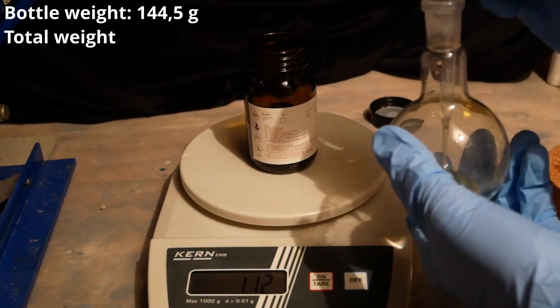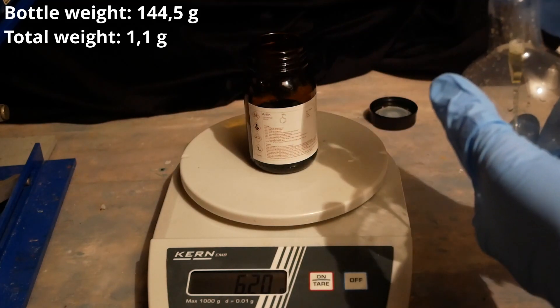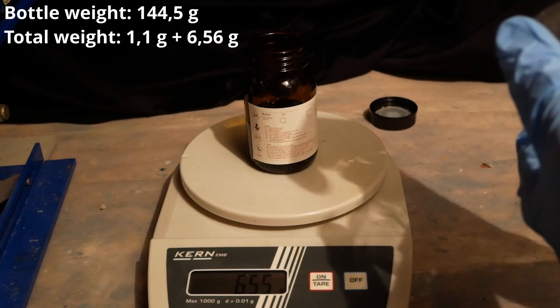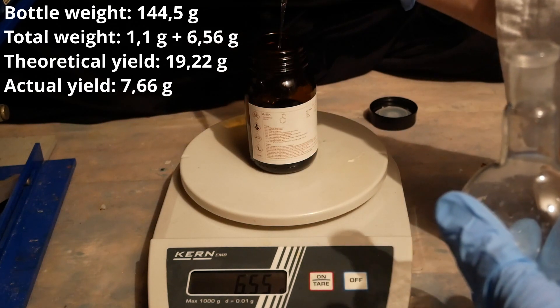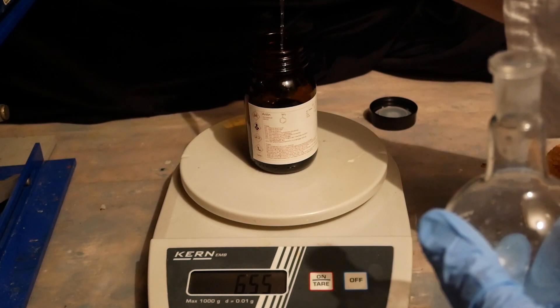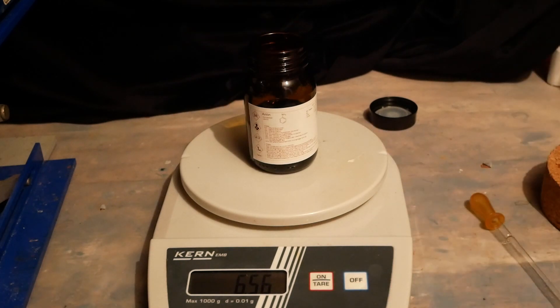I accidentally didn't tare the scale right away and put a gram in the bottle before, but together with the six and a half grams on the scale, our total yield comes out to be 7.66 grams, which gives us a 40% yield, meaning the yield is effectively doubled, and my ego is pleased.